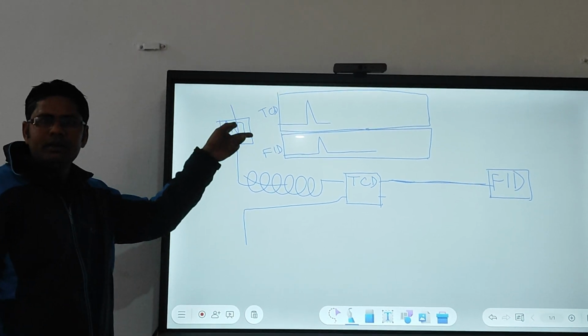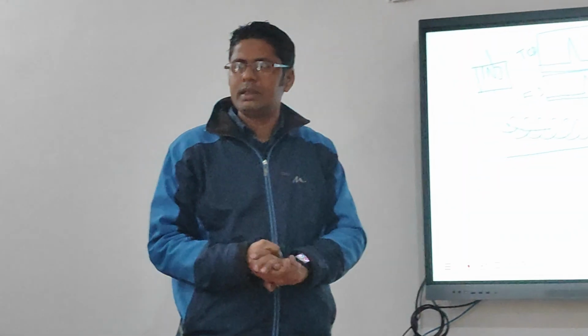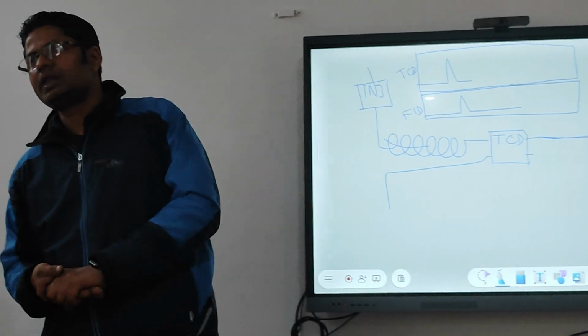You understand this? So, in the same instrument is it possible? Yes, it is possible. I will show you the instrument installed there, na? And this concept is used. It is called Analyser GC, customized GC, turnkey analyzer.